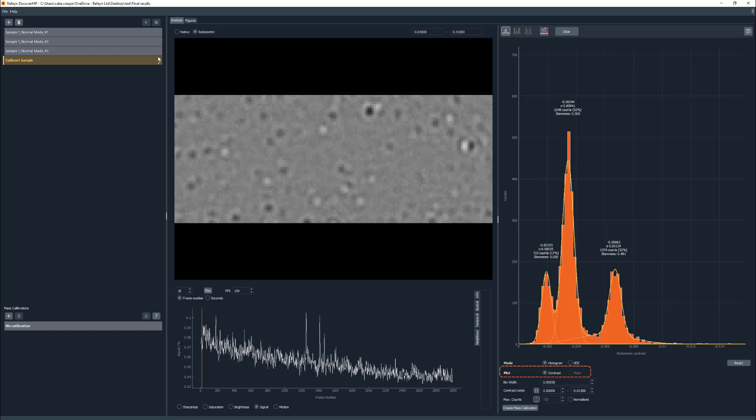X-axis units of the plot can be defined as contrast or mass. Please note that mass can only be used after applying a mass calibration.